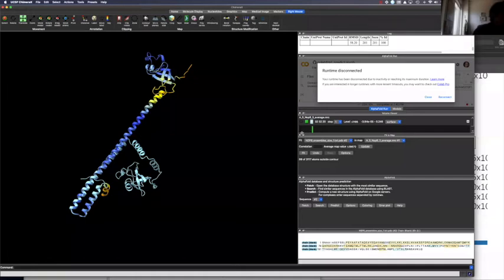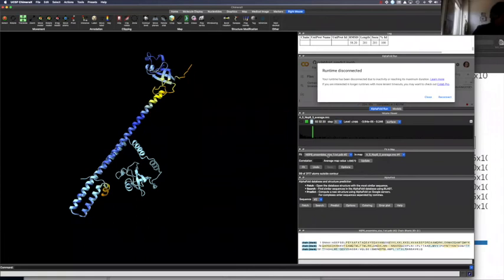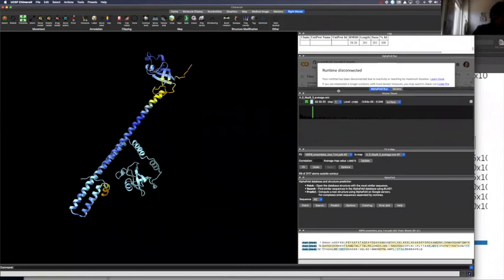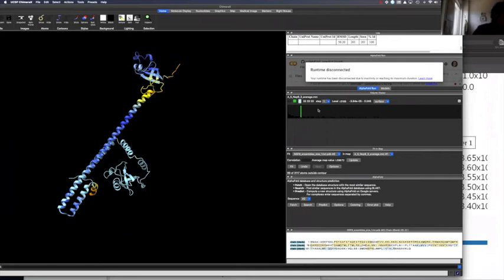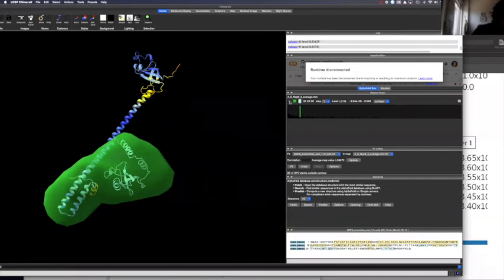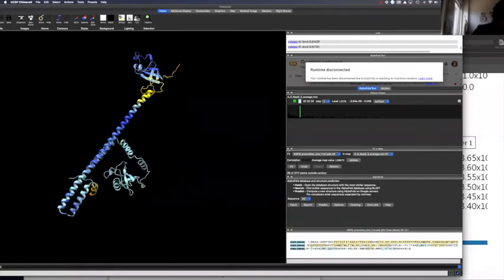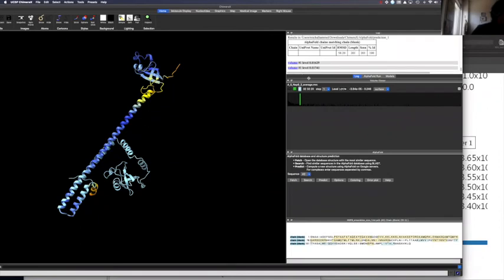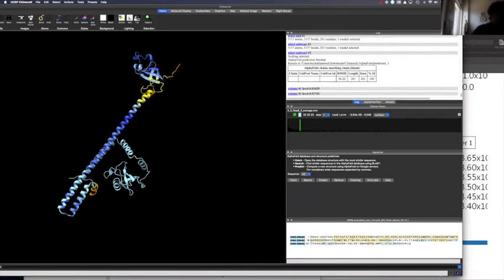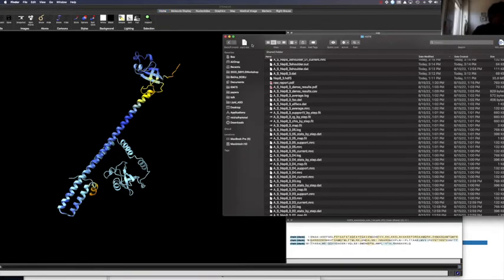And let's just, so we're going to upload the MRC file.